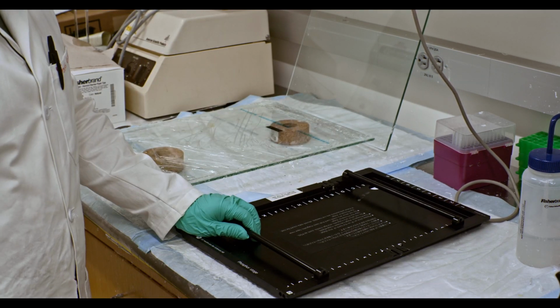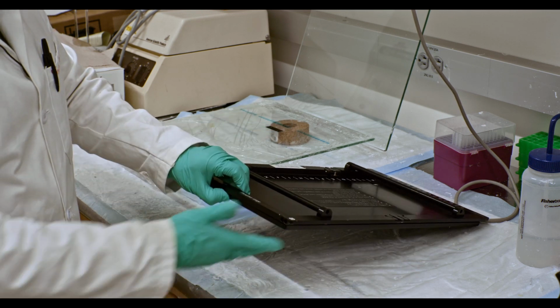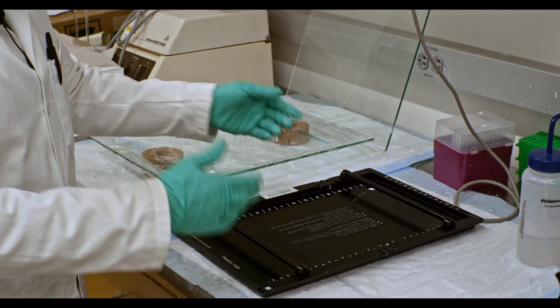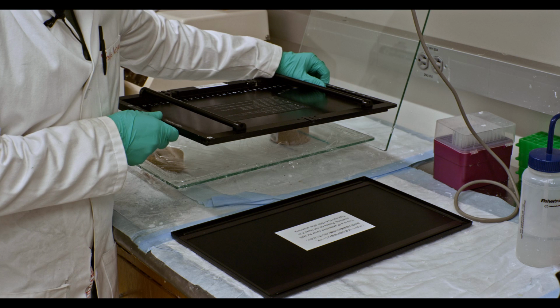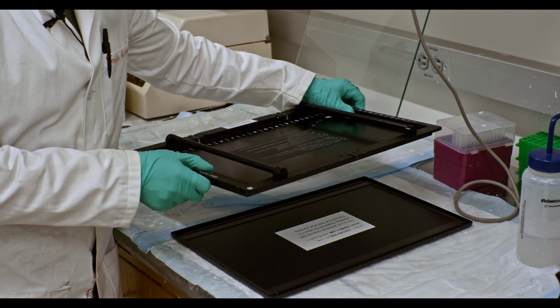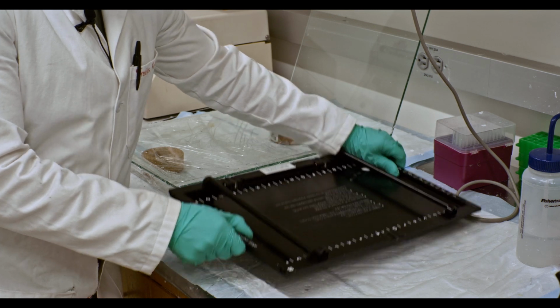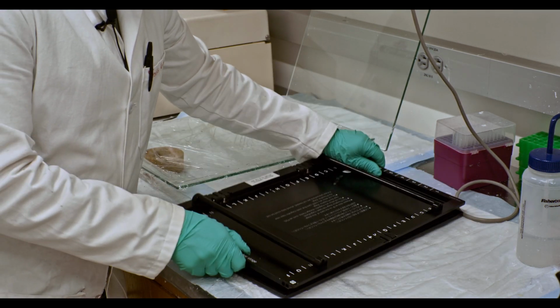One important thing to note, you can do this even with light around, because of course the cassette will protect it from any sort of light that hits it. Even when you take it to the Typhoon, whenever you actually go and insert this cassette, you can see that it's magnetic, so the film is actually not attached to the bottom, it's attached to the top plate. As long as you move around with your film attached to this magnetic part, you shouldn't ever have an issue of worrying that the light will destroy your image.